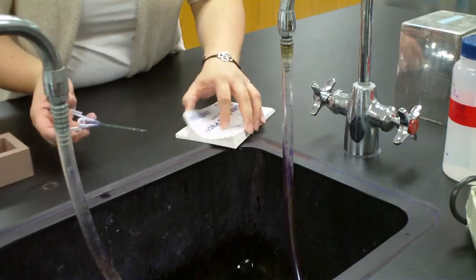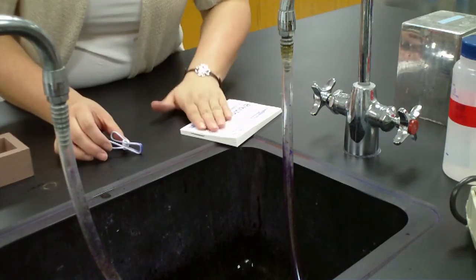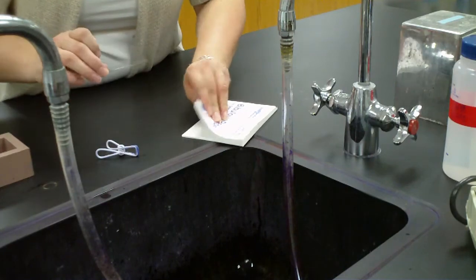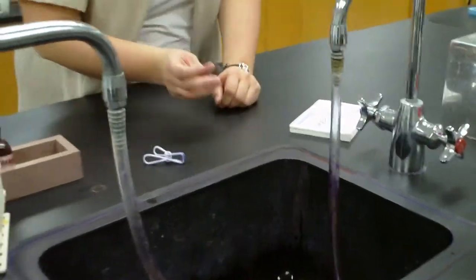I'm going to put it in my bibulous paper, again, open to any page. Take your clothespin off, pat your slide dry. If it's not dry, go ahead and flip to another page. Pat it dry. And then you should have a gram stain slide ready to look at under the microscope. So that's gram staining.